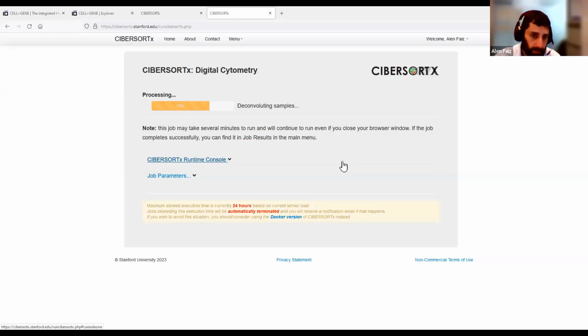So once this is completed, you will have a nice file that you can download, and then you can do associated statistics with this. You can basically do a t-test or Mann-Whitney U or Wilcoxon, depending on if you want non-paired or paired analyses. Just be careful with zeros. If you do have a substantial amount of zeros, again, you probably want to do a non-parametric test.